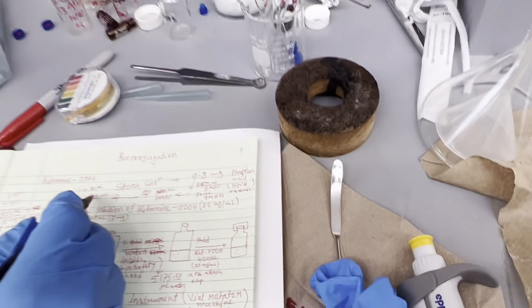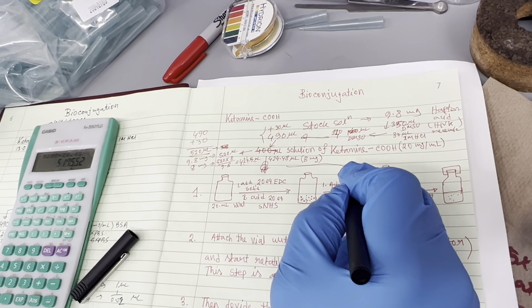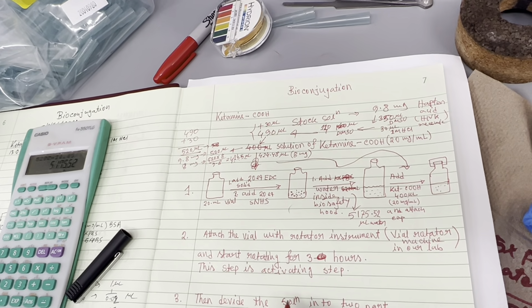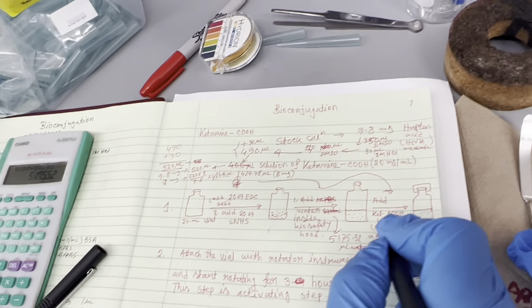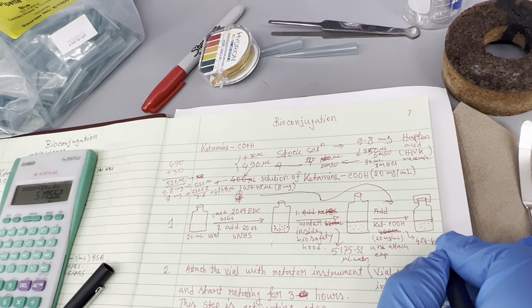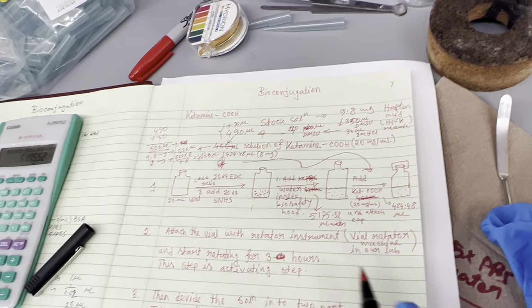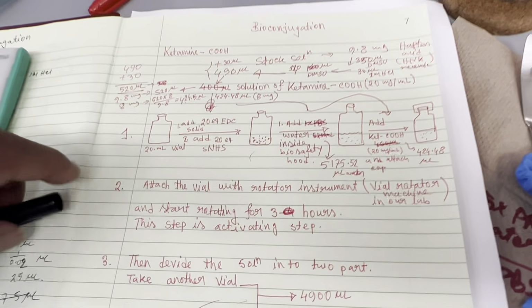So we are going to take 424.48 microliter to add there. You understand? So that's the change that is happening.